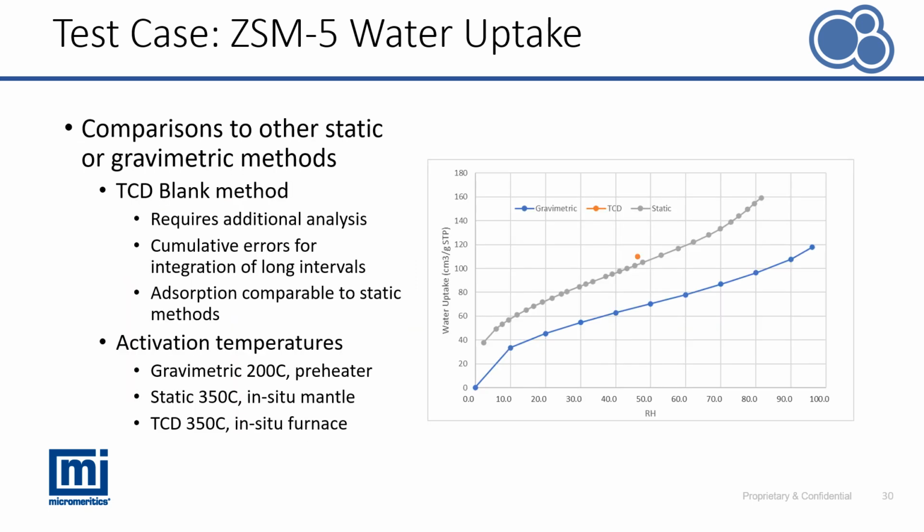The calcium oxalate monohydrate test case had a theoretical value for comparisons. In this test case, we compare the quantities reported to values measured by other techniques. The first technique is a dynamic flow, but gravimetric method. The instrument used for this technique also generates and blends to a specific RH. The limitation of this technique is that the time from in situ drying to analysis can be longer, and the temperature for in situ is limited to 200 C.